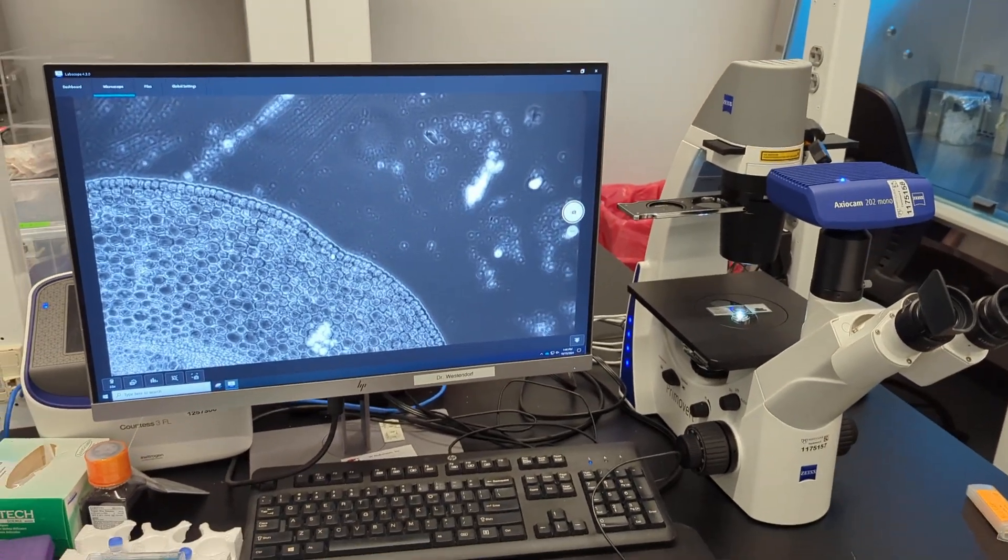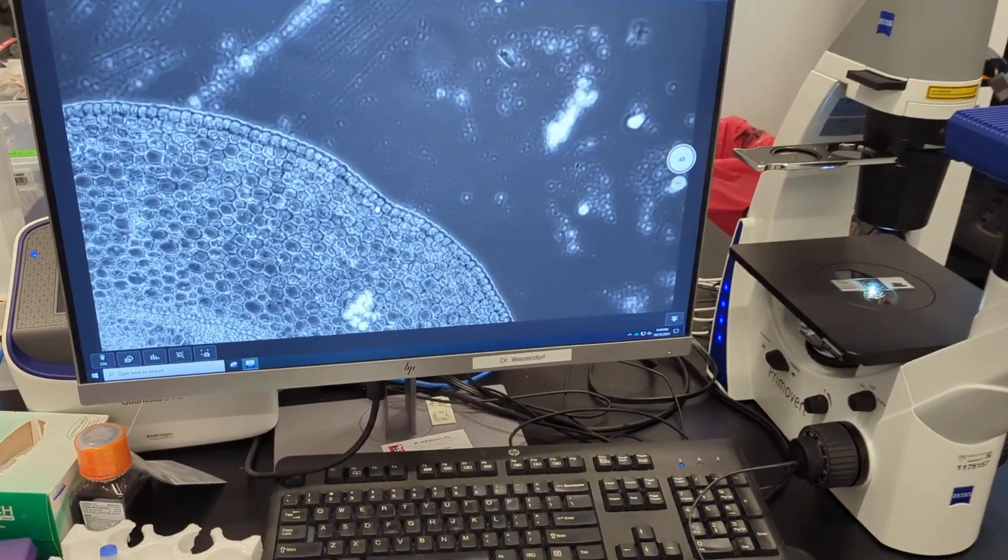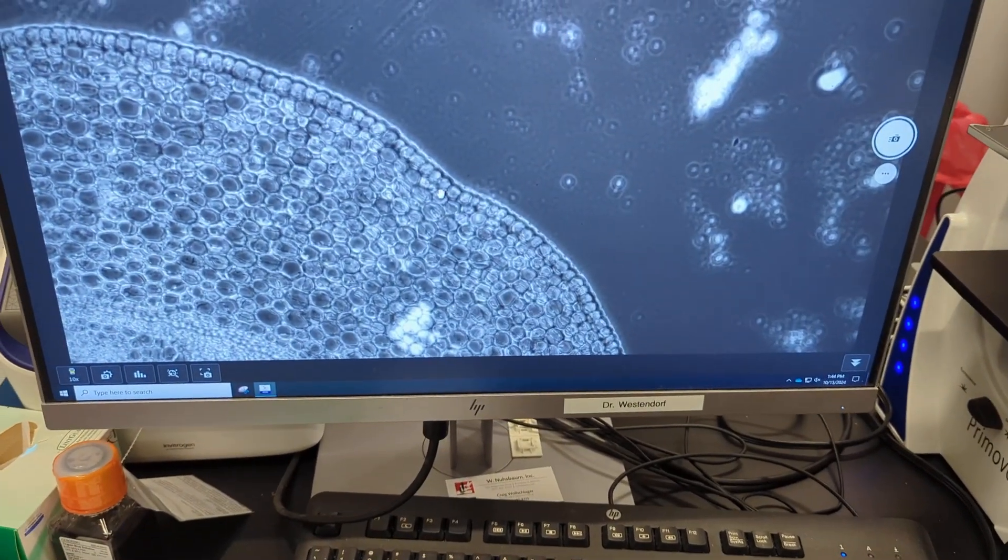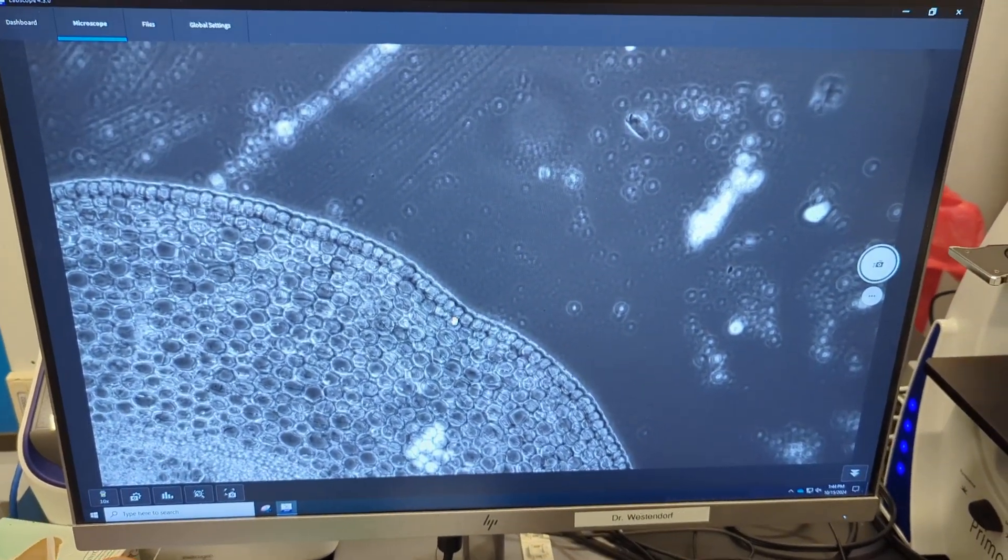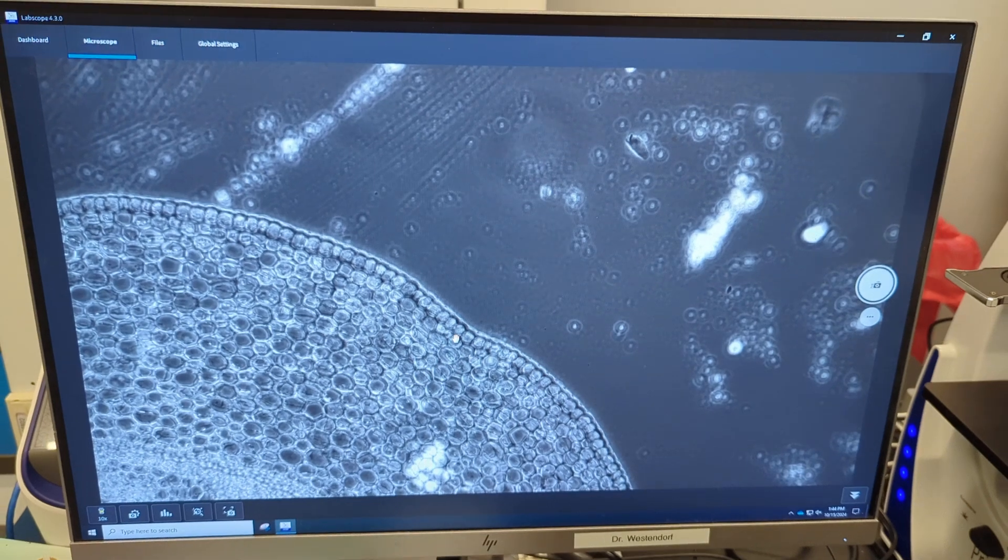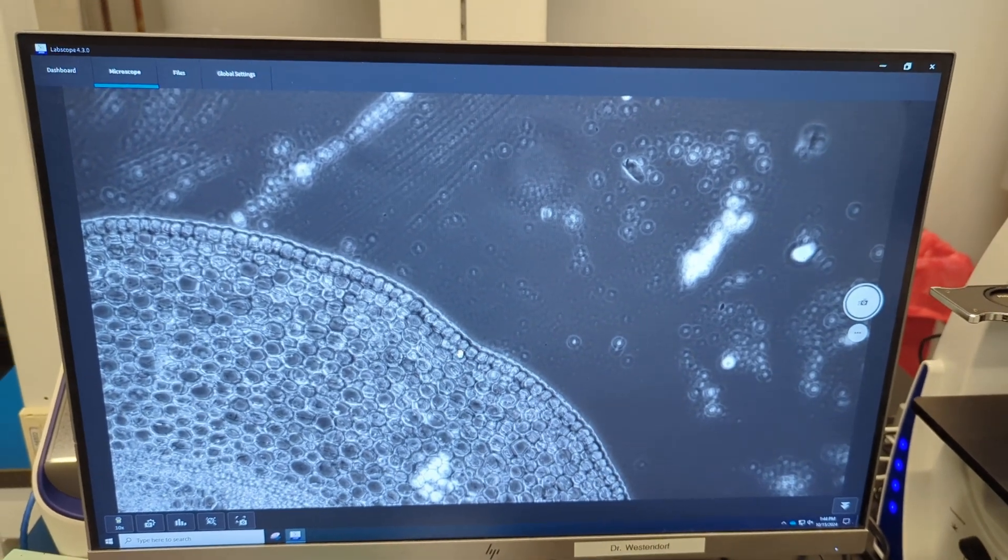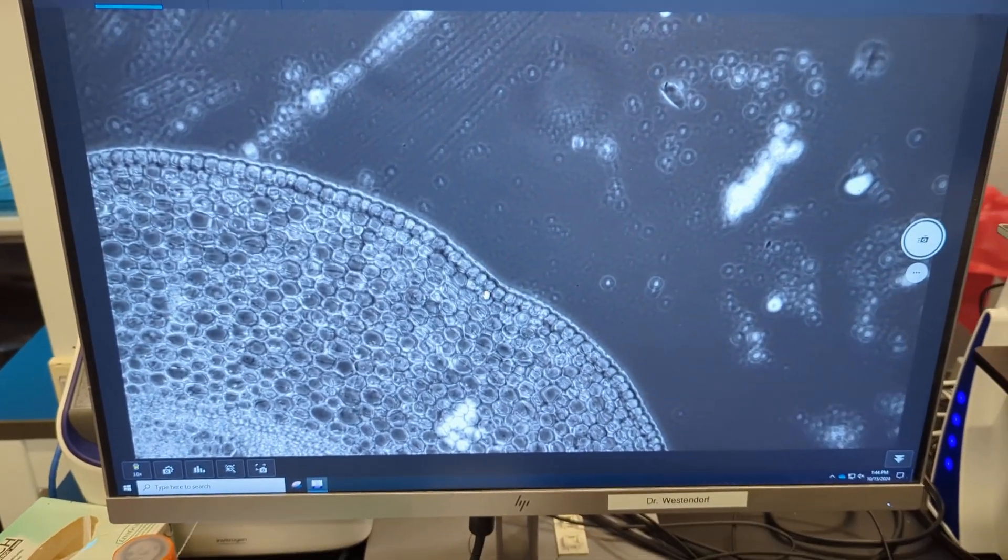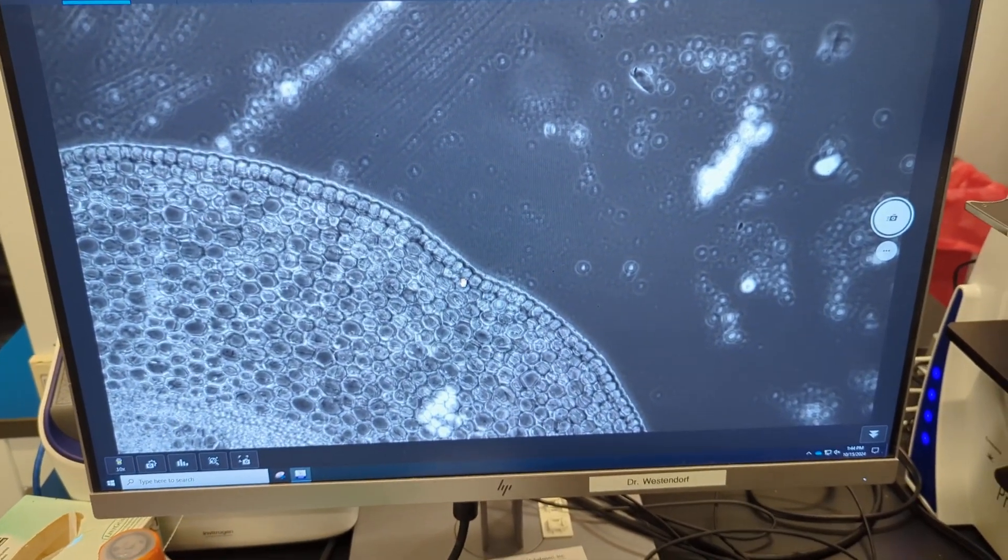So now we're in the Zeiss LabScope software again, and we're going to do a quick live counting in cell confluency using the AI modules.